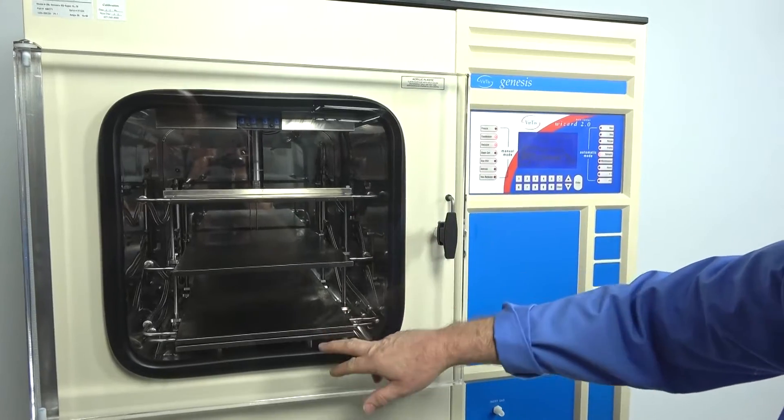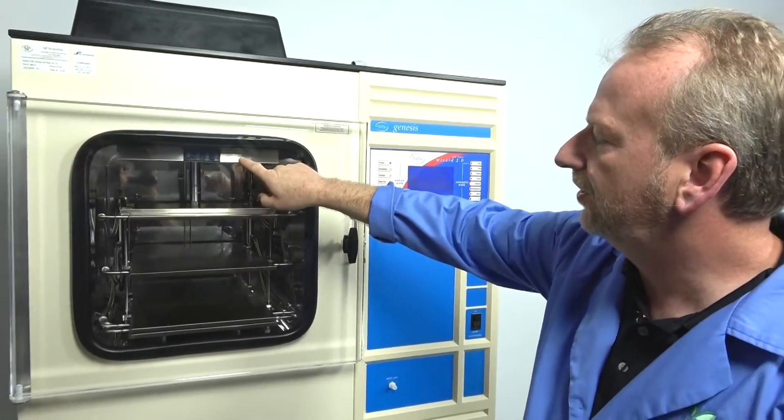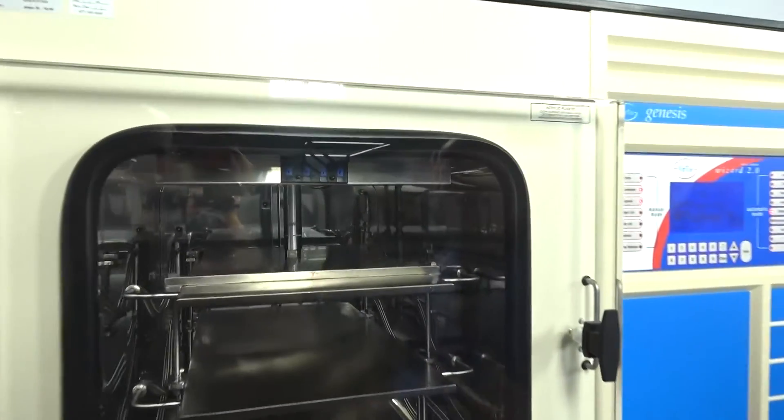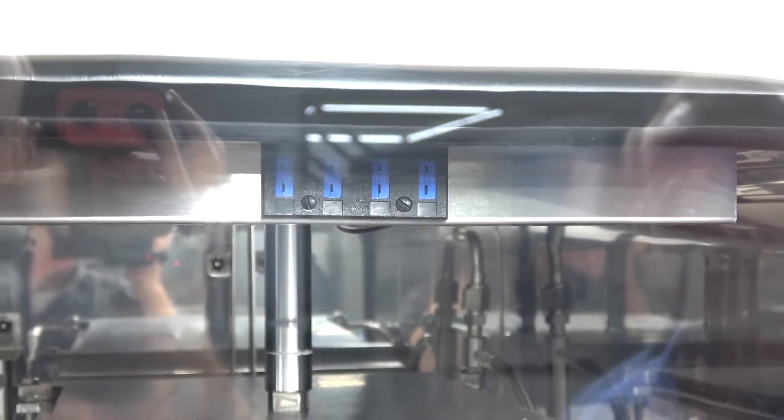It has three shelves, and it also has all the thermocouple plugs so that you can measure each individual shelf or even some of your products to really maintain a good recipe for what you're doing in the freeze drying process.